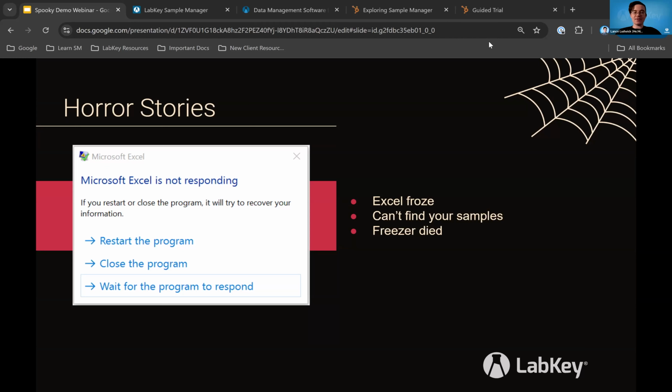And then working in the lab, it was also scary when you couldn't find a sample that you really needed in a pretty fast way if you had some urgent testing you needed to get done. Maybe that spreadsheet you were using to track where your samples are wasn't updated, so that can be really difficult. Or maybe the LIMS you work with is hard to use, so people don't accurately mark where their samples are, or it's just difficult to know where to search for them in that system.